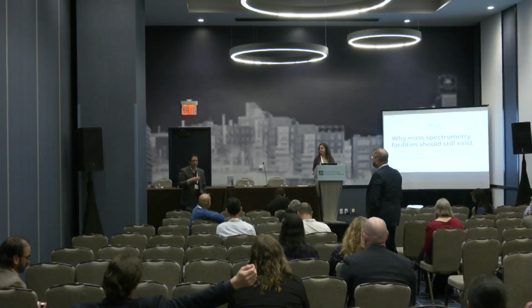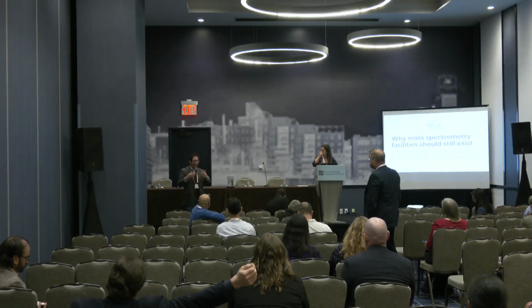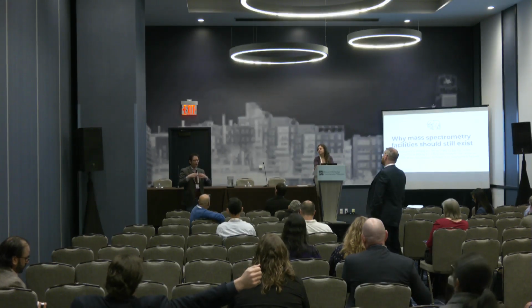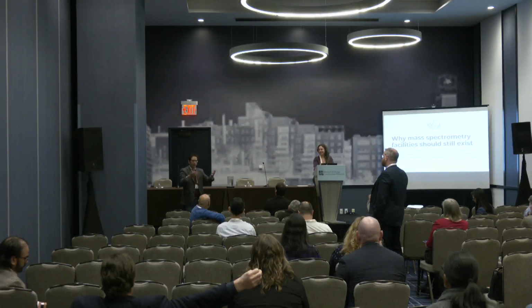I think what Lindsay is saying is that I don't think that the question works because the technologies are so different from each other. If you want to take Olink or Soma and answer a question that can only be answered with mass spectrometry and try to pit them against that question, like PTMs, like you just mentioned, that's a hard problem for Olink or for Soma.